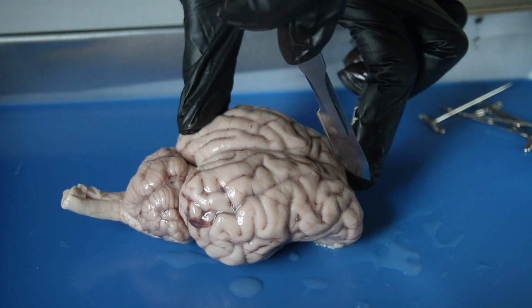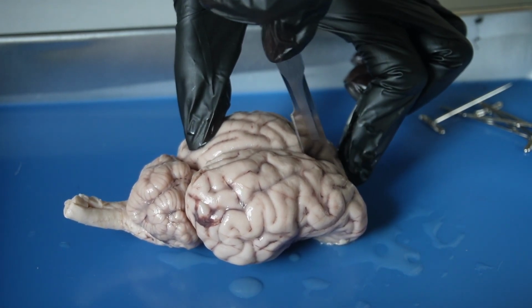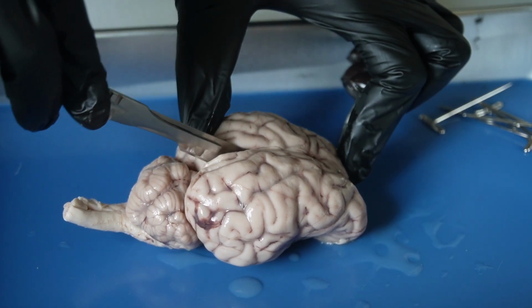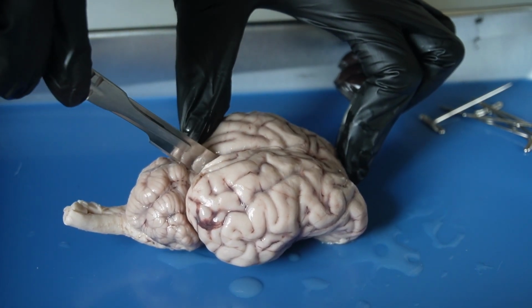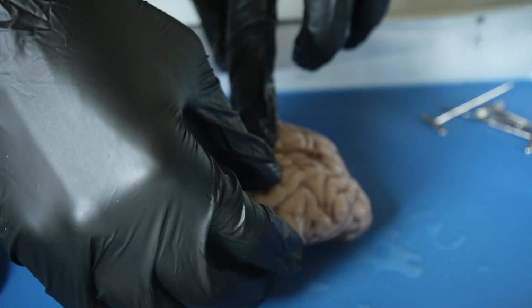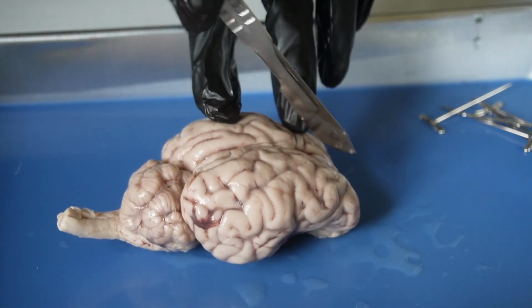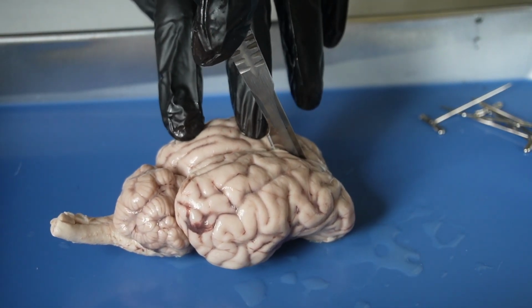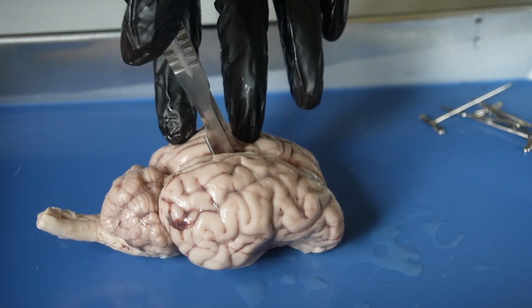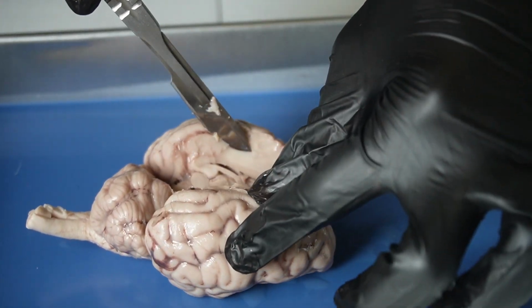So since I am making this incision sagittally, I figured it would be easier. Bloop. Oh, probably didn't make it deep enough. Yippee!